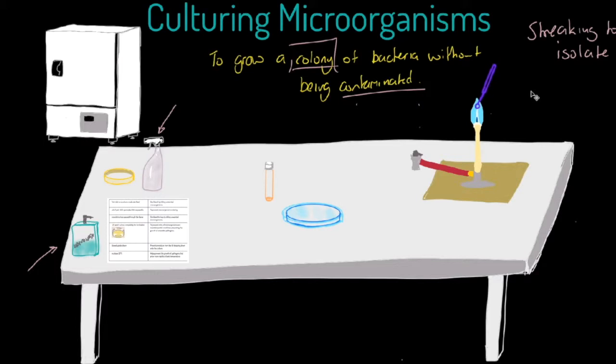The reason for that is to kill off any bacteria and sterilize the loop. Once we've done that, we let the loop cool slightly, then take it into our bacterial culture. We then lift the lid on our petri dish as little as possible and start to streak our agar plate.